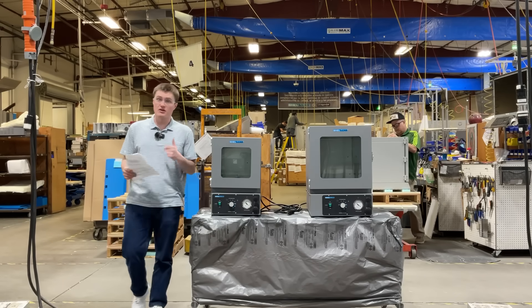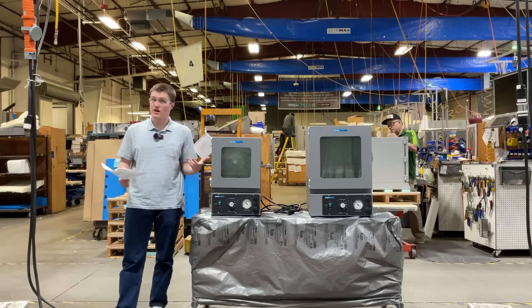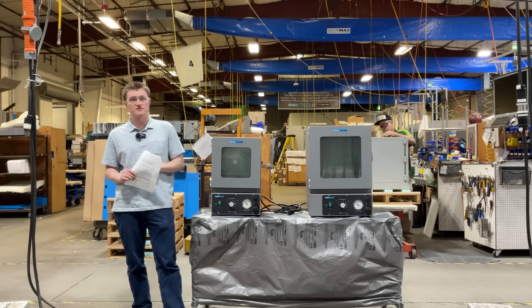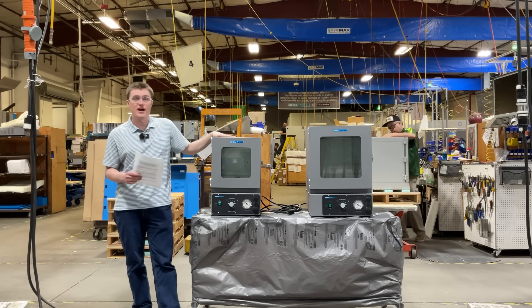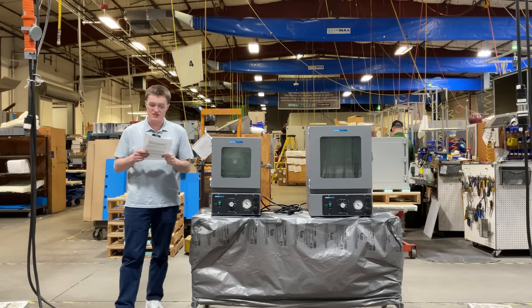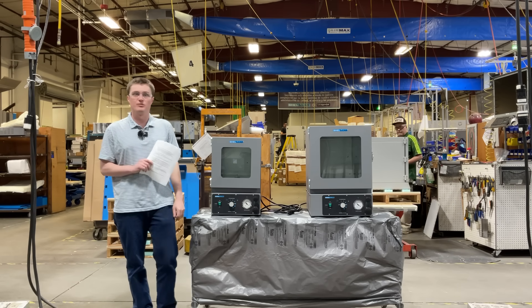Whether you need safe and controlled solvent removal, to cure or degas components without oxidation, or to safely dry and remove moisture from heat-sensitive samples, Sheldon Manufacturing's S-Vac-E series of vacuum economy ovens are perfect for your needs. They offer unmatched reliability, efficiency, and affordability.